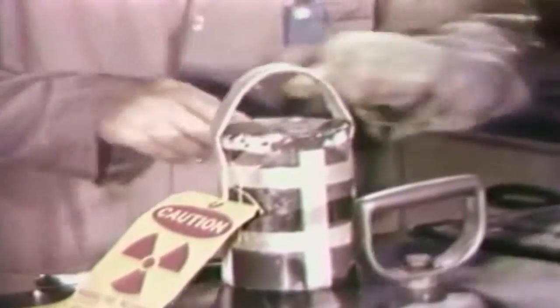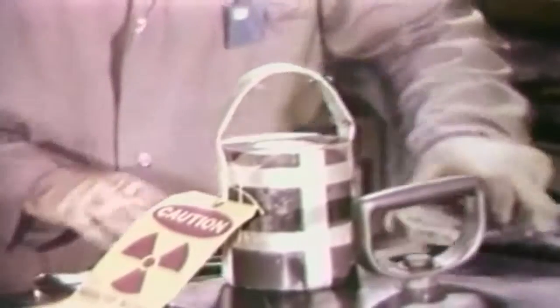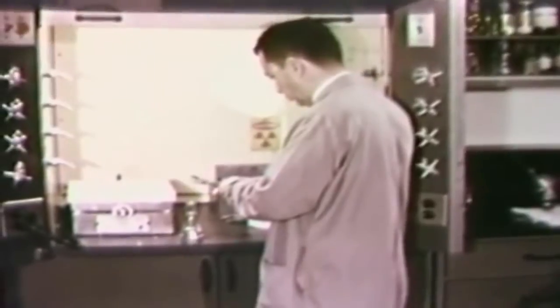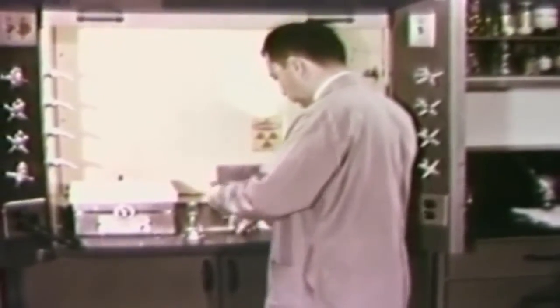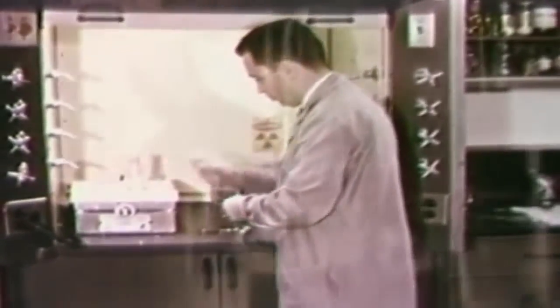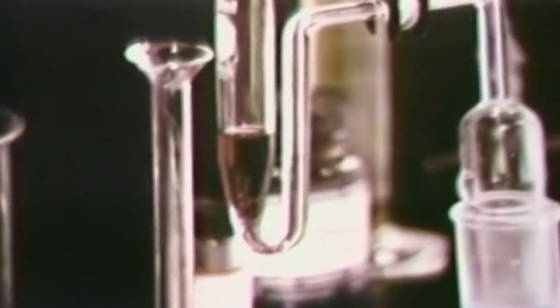Here in the neutron activation analysis unit, the samples are unpacked. Before the examiner can measure any arsenic which may be present, it must first be isolated from other radioactive constituents of the bone. When the bone was exposed to the neutrons, atoms of many of the elements present were made radioactive. After chemical processing, any radioactive arsenic will be isolated in this liquid.